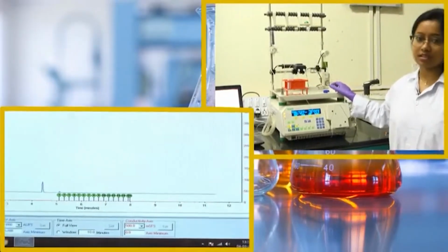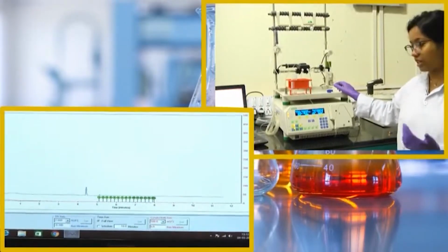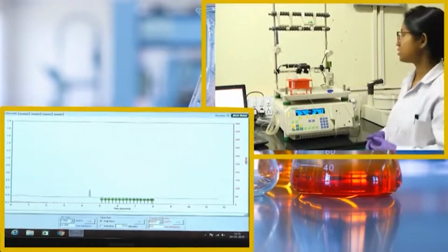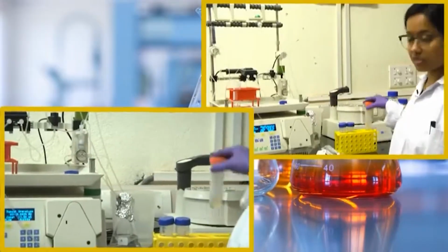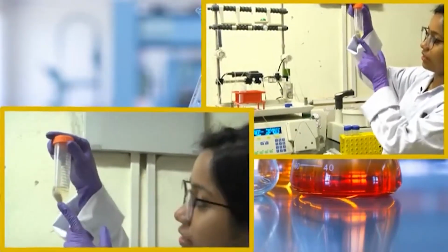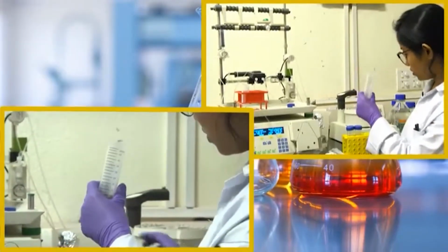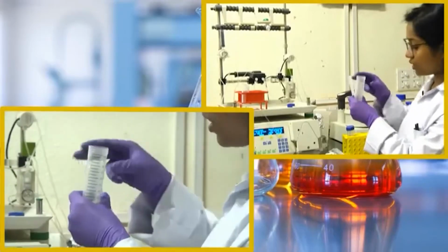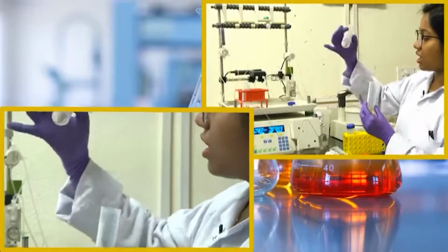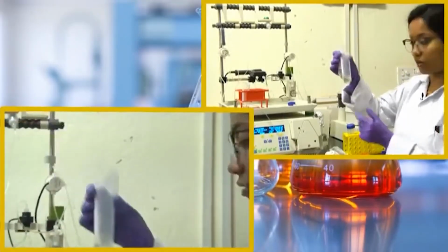In the meantime, the centrifugation will be over and we will separate out the supernatant and the insoluble pellet fraction, and then we will run the soluble fraction through this column. So, our centrifugation has been done and you can clearly see there is the supernatant and the pellet fraction. Right now, after the centrifugation is over, we will separate the solution fraction, basically decant it. This is the pellet fraction, the insoluble fraction, and this is the soluble protein fraction.